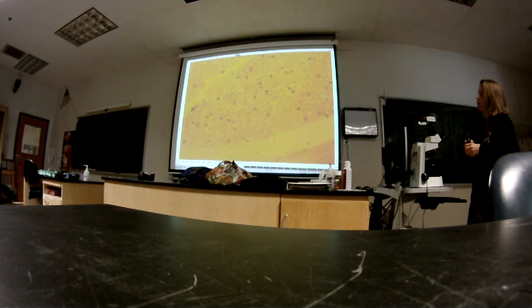Is the myelin sheath a Schwann cell? The myelin sheath, yes, is the Schwann cell. The Schwann cell forms the myelin sheath. And these nuclei that you're seeing, those are from the Schwann cells. See the purple? And that's not on your list.